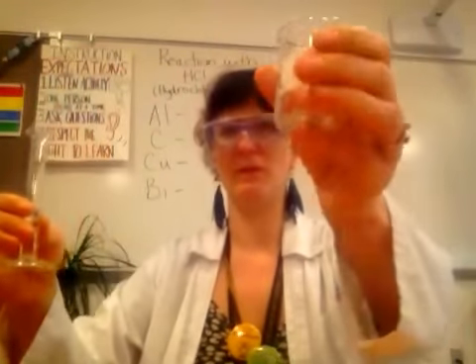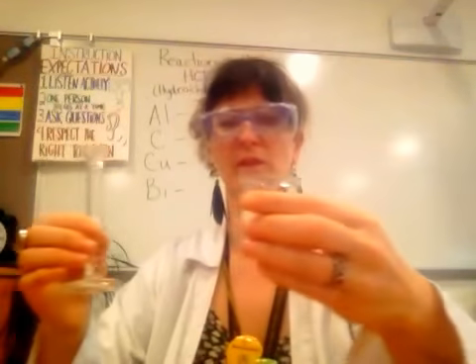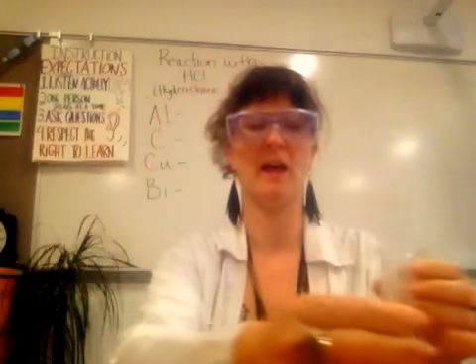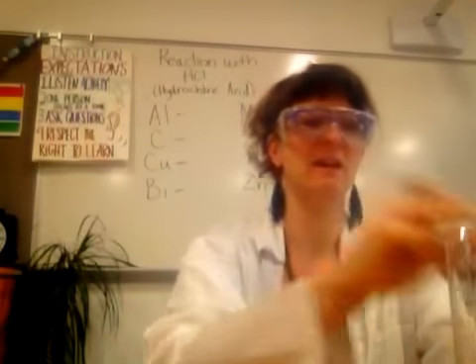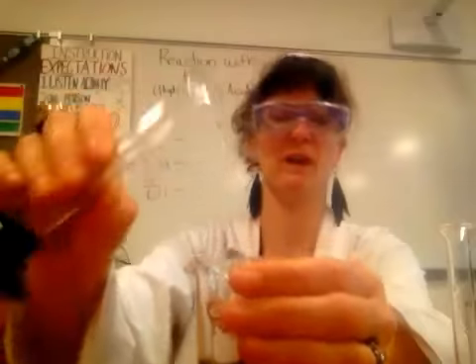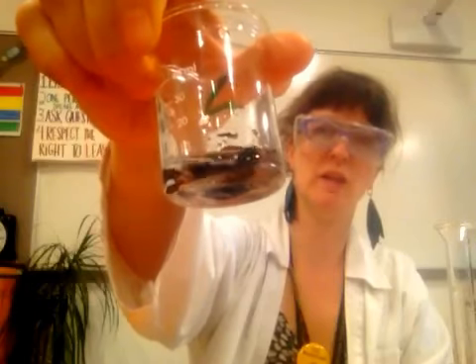So I'm going to start out with about 6 milliliters of this, like I said, with the aluminum. So that's what the aluminum looks like. You took some observations of it last class. So I'm just going to add a little bit of that, switch it around, kind of show you what we've got so far. I'm going to set that aside. Then I'm going to do 6 milliliters of hydrochloric acid with the carbon. So again, remember that carbon was that kind of chalky looking black substance.